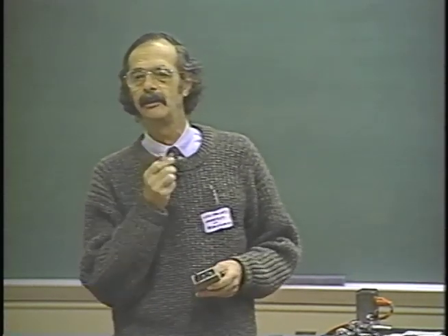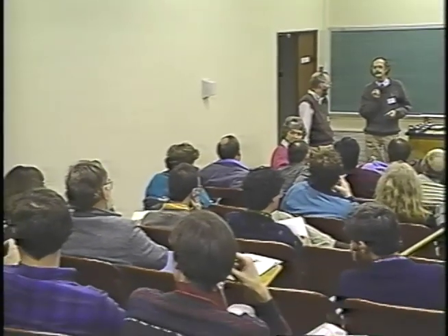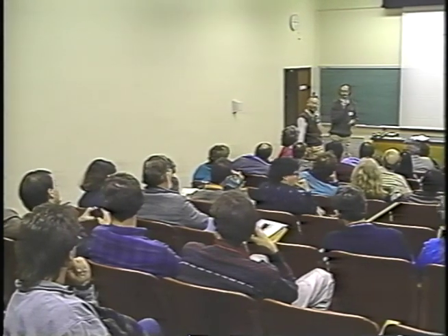David Agard: A little bit of that with the small golds in your tomographic data set. Because we sample a lot of angles, you can actually see them flickering in and out versus tilt, when we do it in practice. Dr. Agard commented that with the very small gold particles, they see the same effects. How small? Even 5. Even 5, yeah.